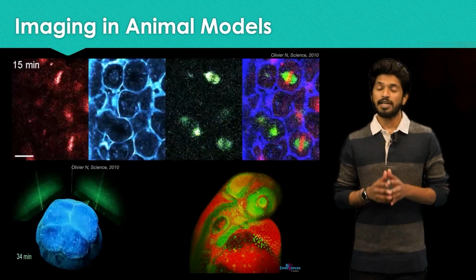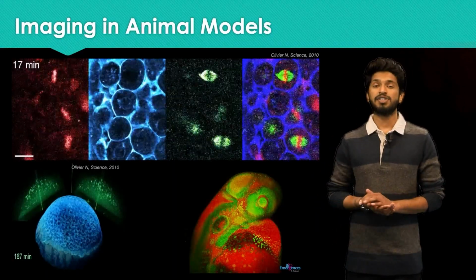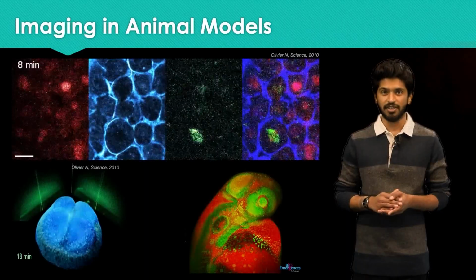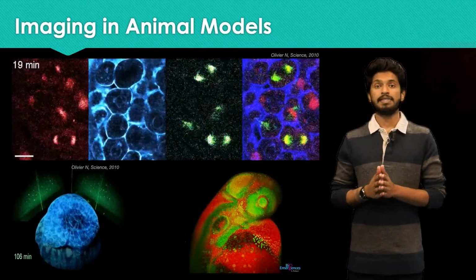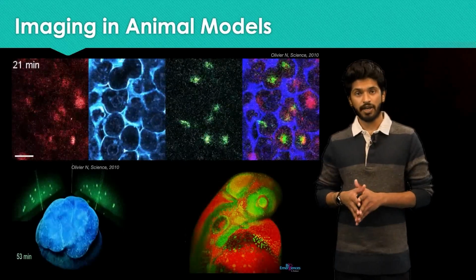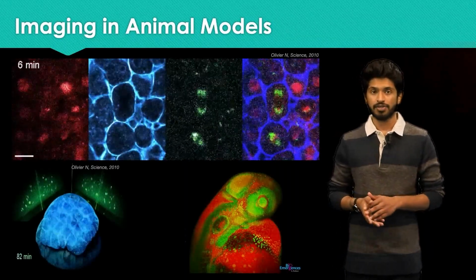Imaging in models is crucial to understand biological mechanisms and characteristics. Using animal models, we could study different scientific hypotheses clearly and look into cellular interactions and study them at a higher resolution. Models include in vitro and in vivo models, in vitro being cells or tissues cultured outside the organism, allowing us to image them either with bright field or fluorescence microscopy techniques, and in vivo models include imaging in live animals like zebrafish or mouse.